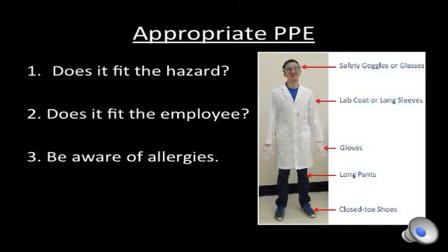When you use your hazard assessment tool, be sure to select the PPE that is correct for the hazard that is present. For example, you may not be able to wear regular nitrile disposable gloves with certain chemicals you are using, and will need to select an alternative.